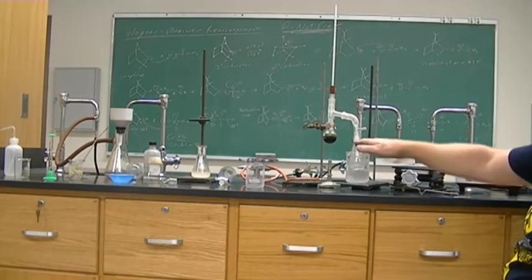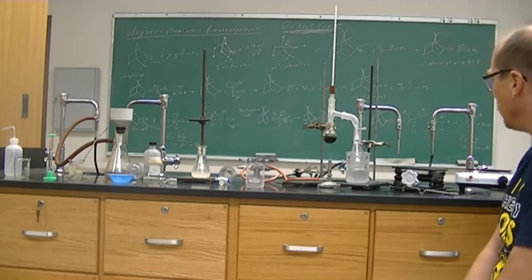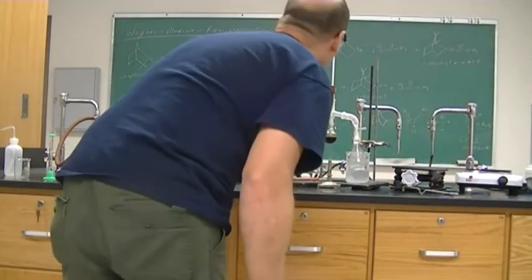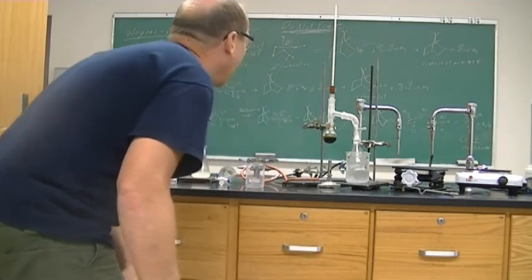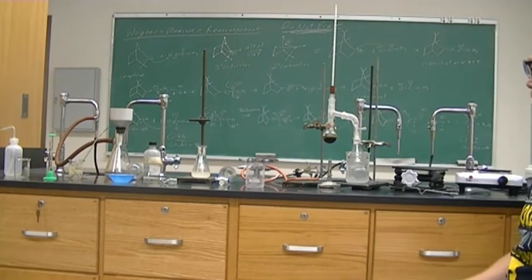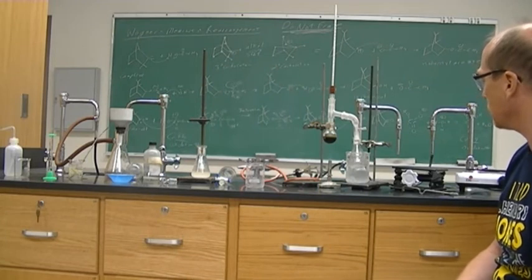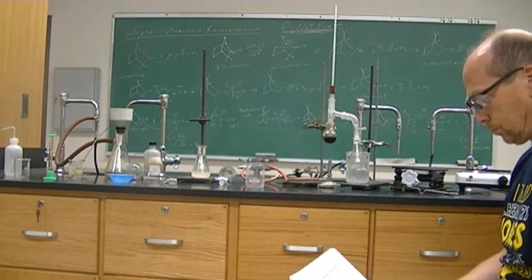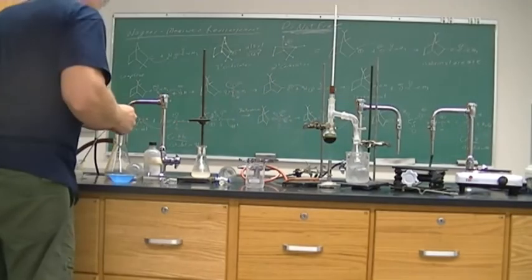So it's staying cool down here. I don't want it to evaporate back out. I want it to stay in the flask. All right, and now we are collecting, and our temperature is at 100 degrees right now that we are starting to collect our liquid at. Get your funnel ready. We're going to collect in your funnel.